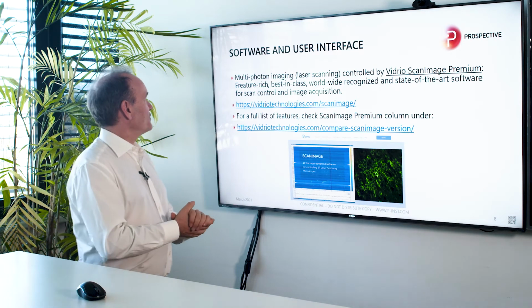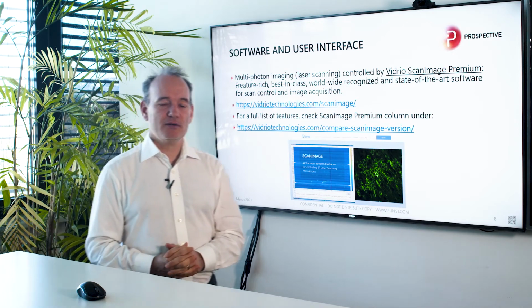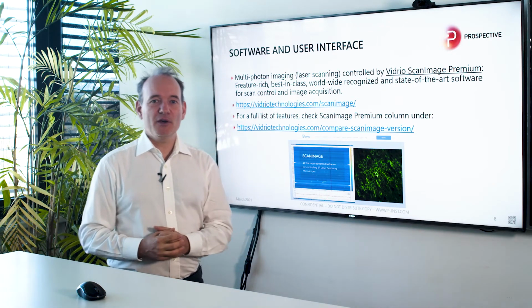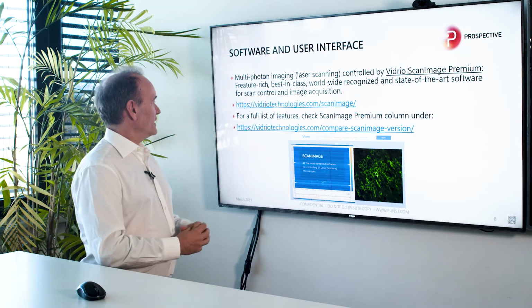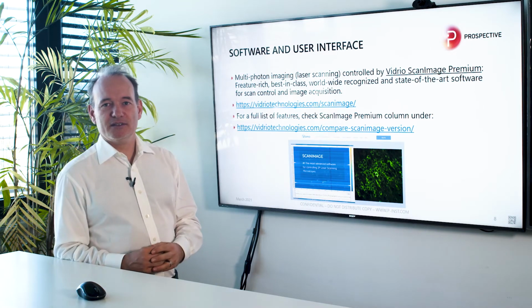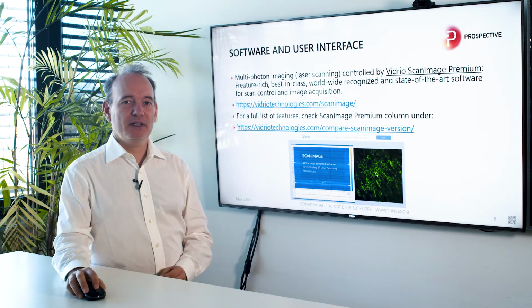So a quick overview for the software and the interface. We are using ScanImage as our main scanning software. I think it's well known in the community, actually, and not much to say. It's pre-installed on all our systems, so you just double click on it and it opens, and it's ready to go from the very beginning.